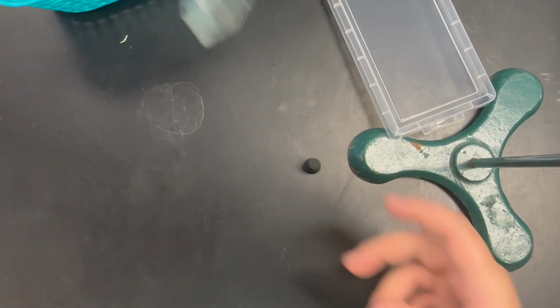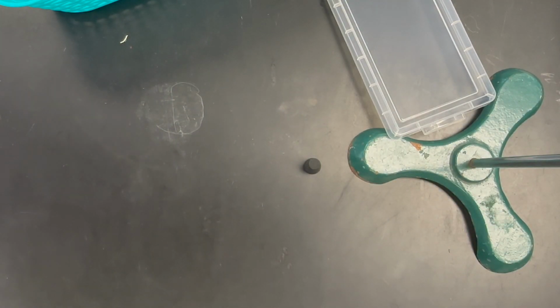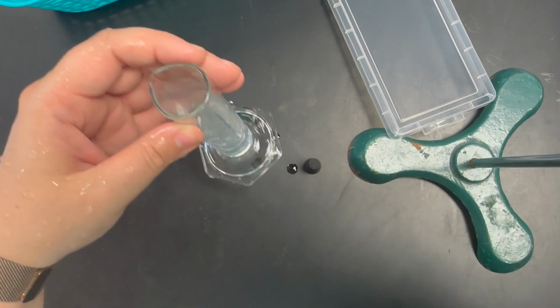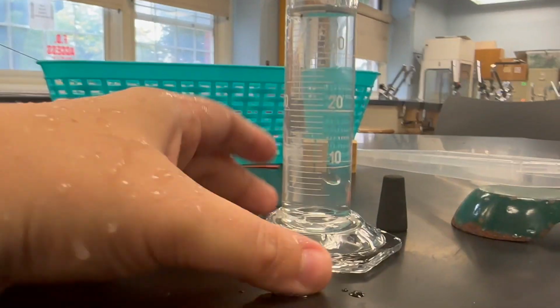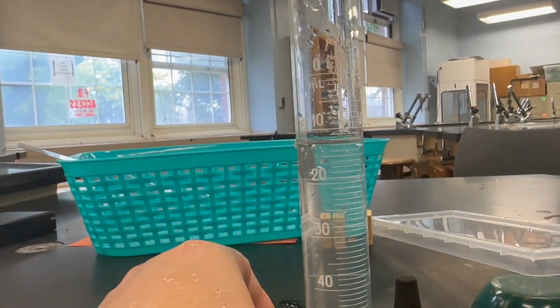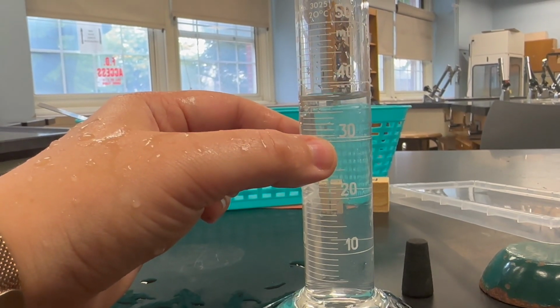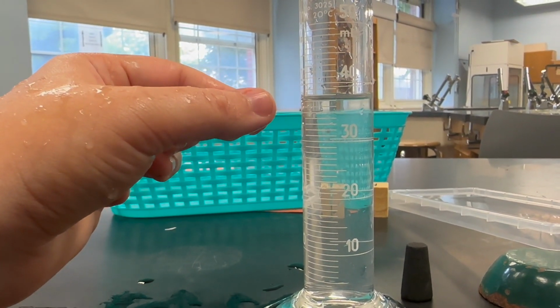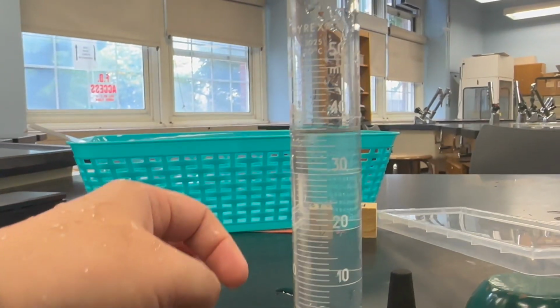Then we're going to take our graduated cylinder and fill it up about halfway. It doesn't need to be exact. So filled it up. Now when you're looking at a graduated cylinder, you want to look at where the meniscus is. So that's that middle part. So again, you have 2 different sides. You have 40 up to 0. You have 10. We're going to start here and go up. This is 30, about 30, where are we? 5, 6, about 37 milliliters in here.